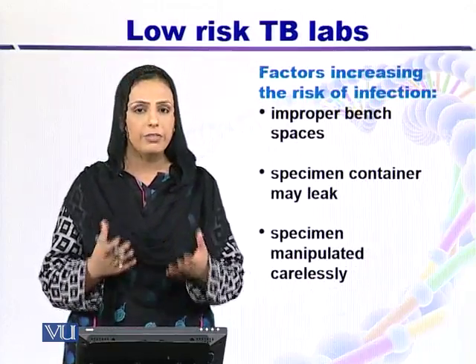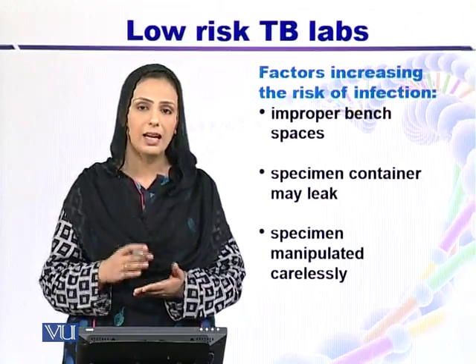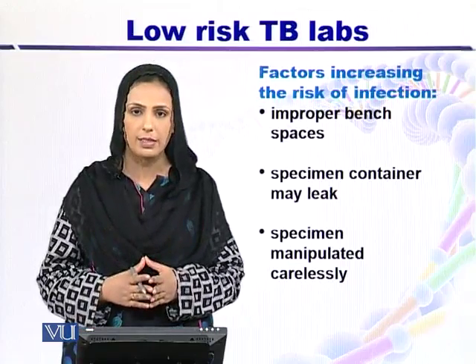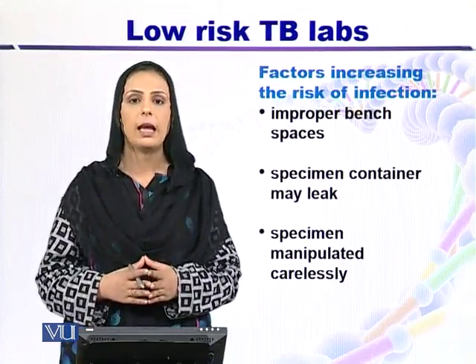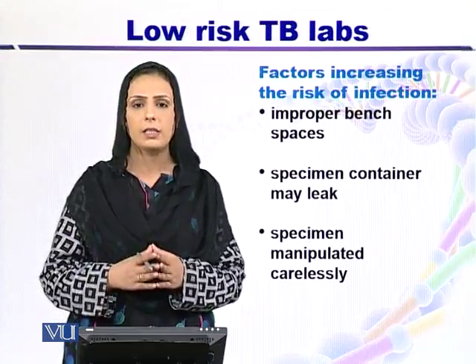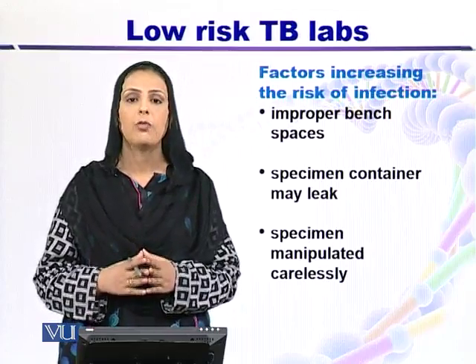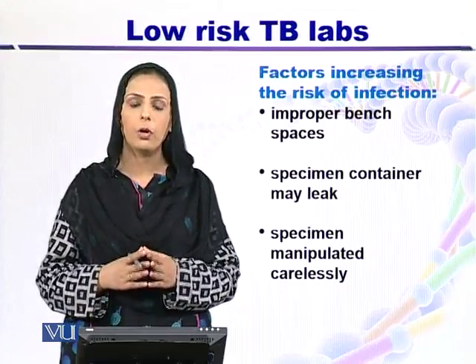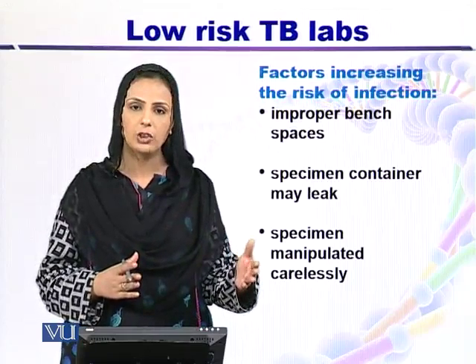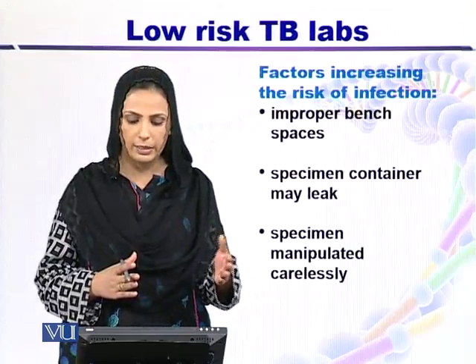Now there are some factors that can increase this low risk towards high risk, such as improper bench spaces. In the TB lab, there must be proper bench spaces, and every experiment should be performed on a separate bench space. For example, if we want to perform staining, then it should be away from the sample collection area and away from the administrative area.